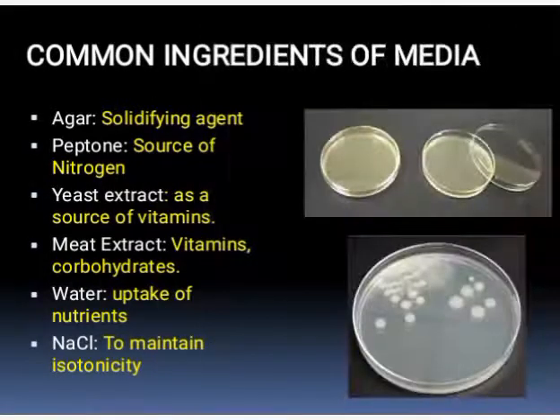You should remember the common ingredients of microbiology culture media. This will help you a lot. The common ingredients of culture media are: 1. Agar. Agar is a solidifying agent. 2. Peptone. This is a source of nitrogen.